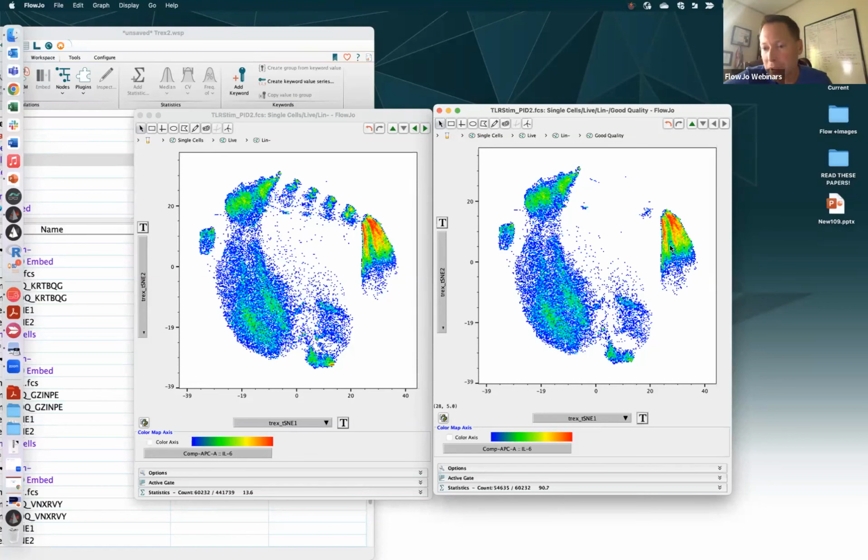Okay. So it's a similar story whether you're using embed or not, but for anything that you'd like to do across multiple time points, multiple instruments, etc., you want to make sure you're comparing apples to apples and coming up with a similar data range.